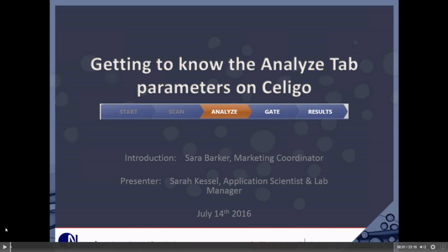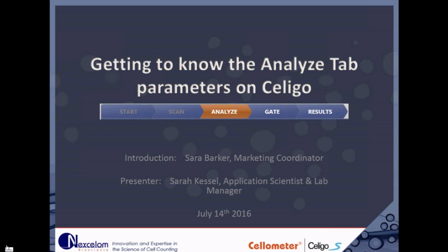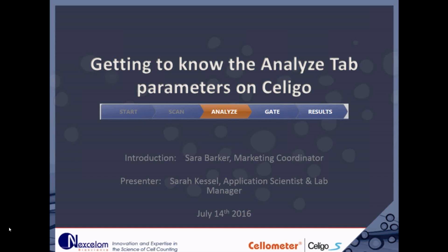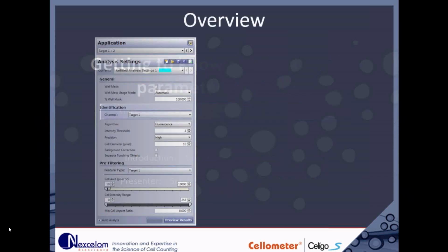Hi, everyone. Thanks for attending today. As Sarah mentioned, this content that we're presenting today has been requested a lot. When you're new to imaging, you are going to be experiencing some new words, some new science. So this is going to help you understand image analysis in the realm of image content analysis. So let's get started. In this image we have the workflow of the Celigo software, and we're going to focus all of the content today on the Analyze tab. It is not going to be application specific, but more about button behavior.